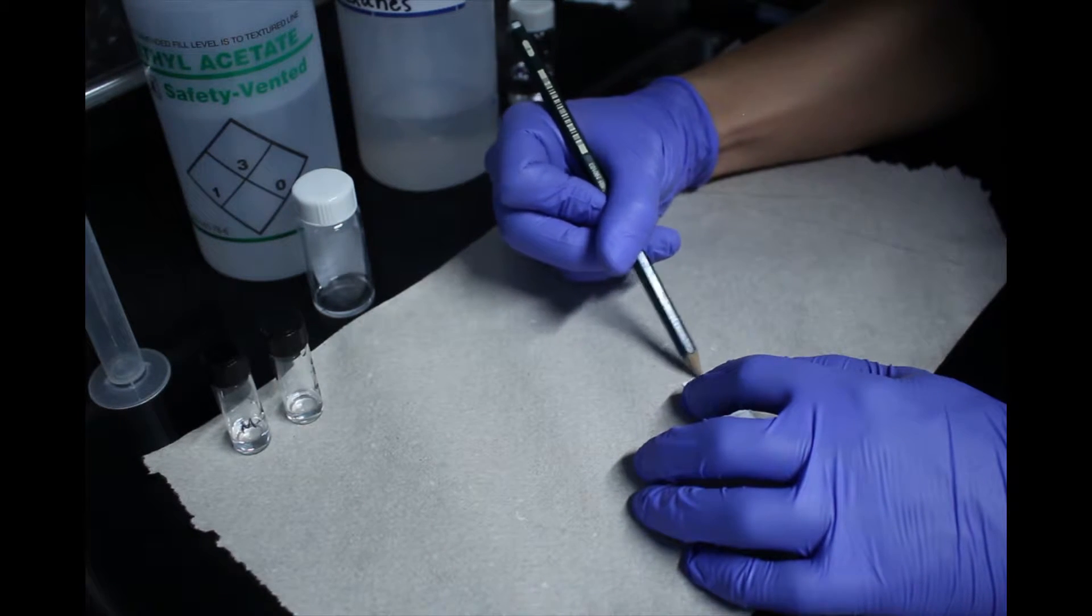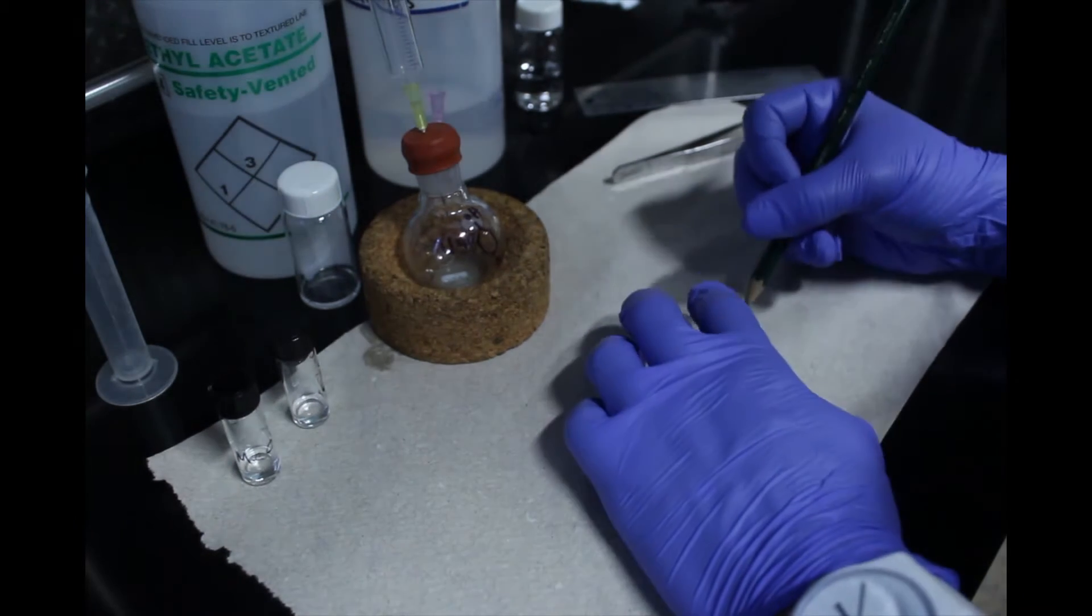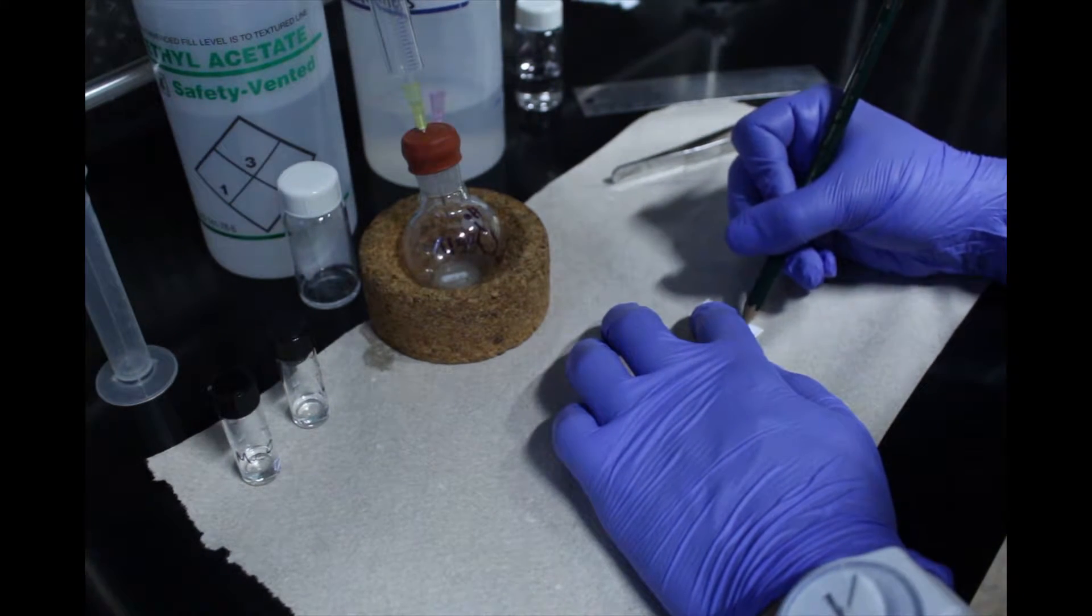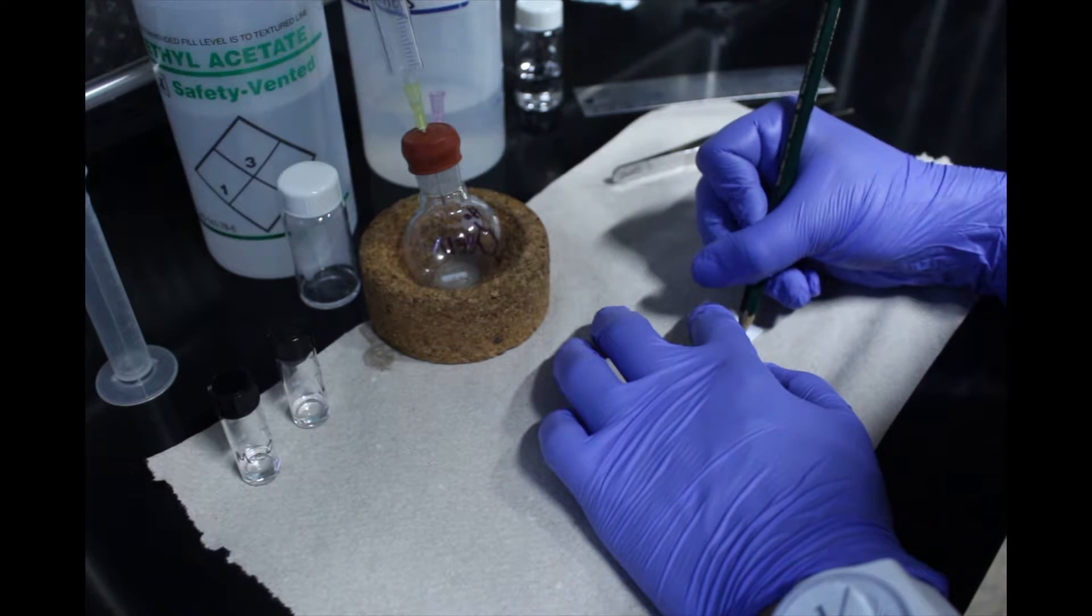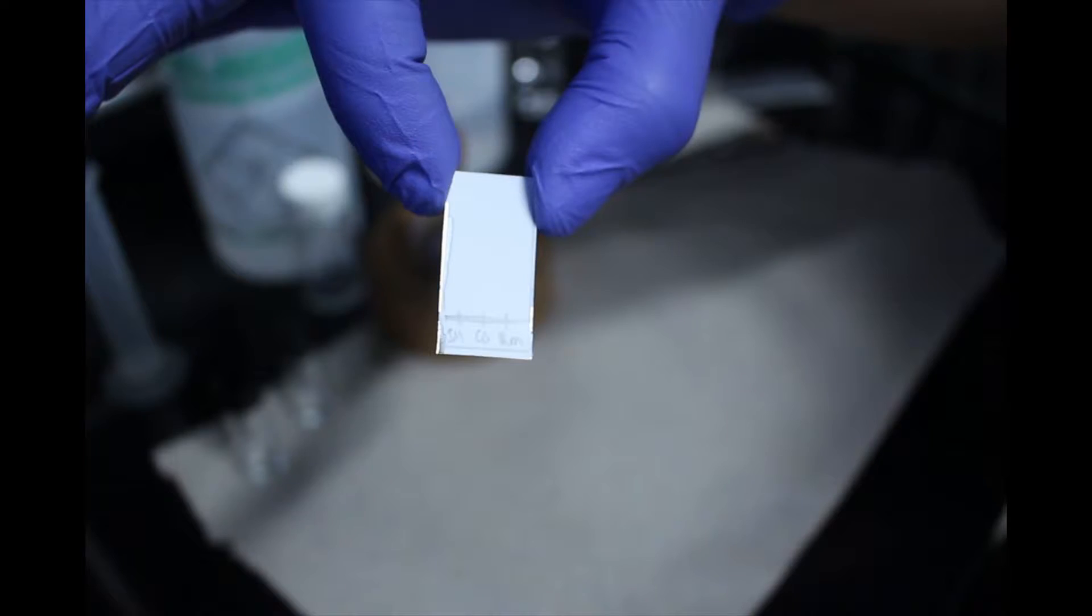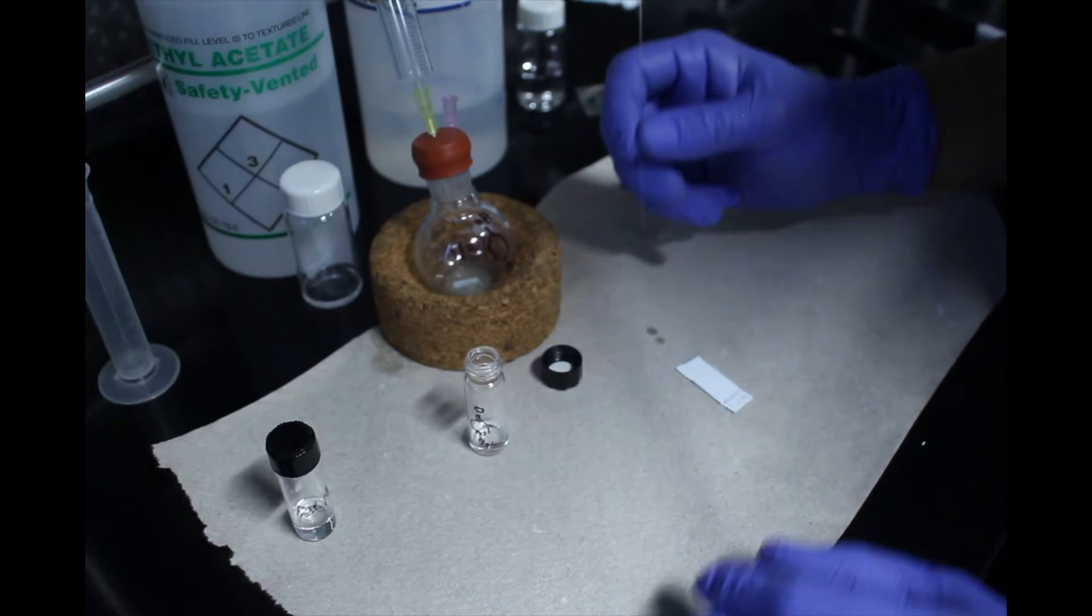To monitor a reaction by TLC, prepare a three-lane TLC plate. Label the first lane SM for starting material, label the second lane CO for co-spot, and the third as RM for reaction mixture.